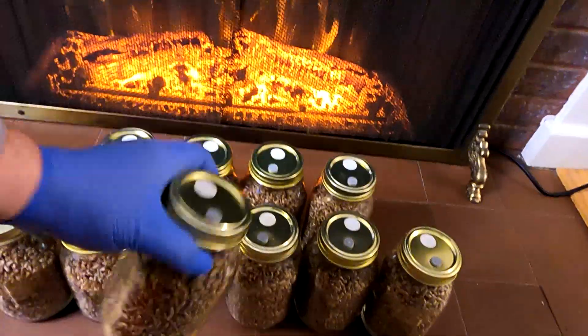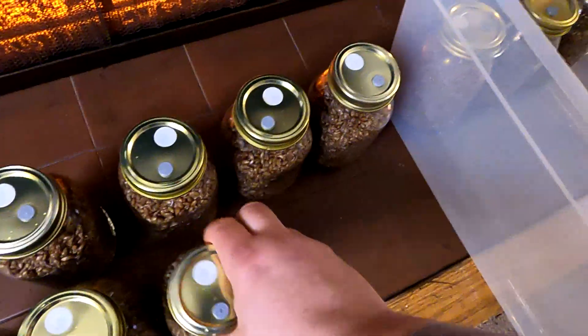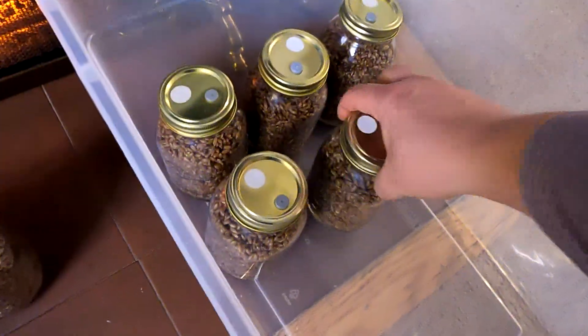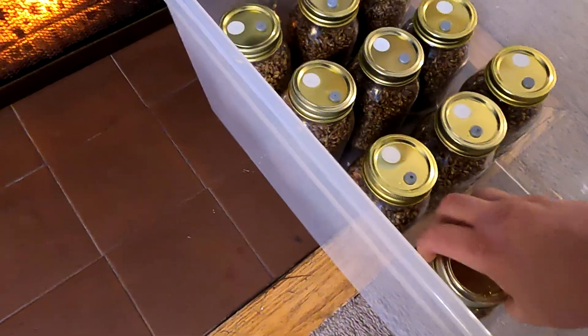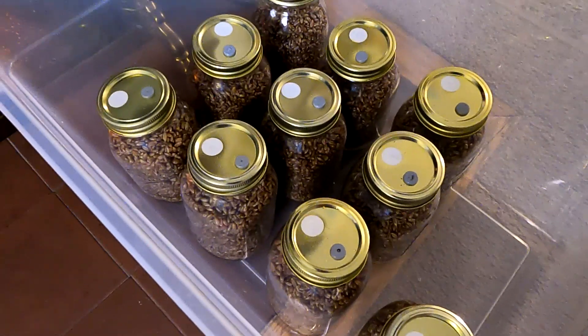Just give all these a good shake. Now we just want to store these somewhere in the house in a room that stays relatively cozy. If you can keep the temperature between 70 and 80 degrees Fahrenheit, that's preferable. As long as it doesn't get too low — that'll slow down the growth of the mycelium. Then we should start seeing the mycelium running through the substrate within a week or so.